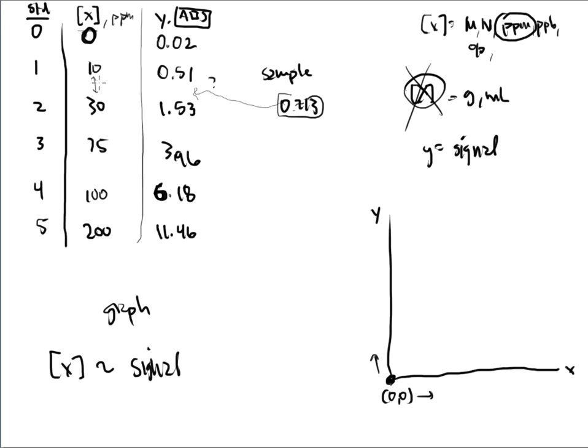That's the purpose of the calibration curve. That's why we do them. That's why we make them. And that is the power of you, not a piece of equipment.